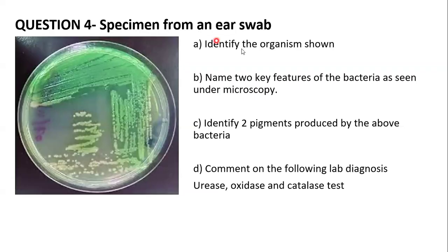But would that only apply to Listeria because it has such high motility, and not for Pseudomonas? I think when you're looking under light microscopy, if you see it via the gram stain, you won't be able to see if it's motile. If you do a proper gram stain, you won't see if it's motile, because by the time all that is done, the bacteria is already dead. So you'll only identify the bacillus.